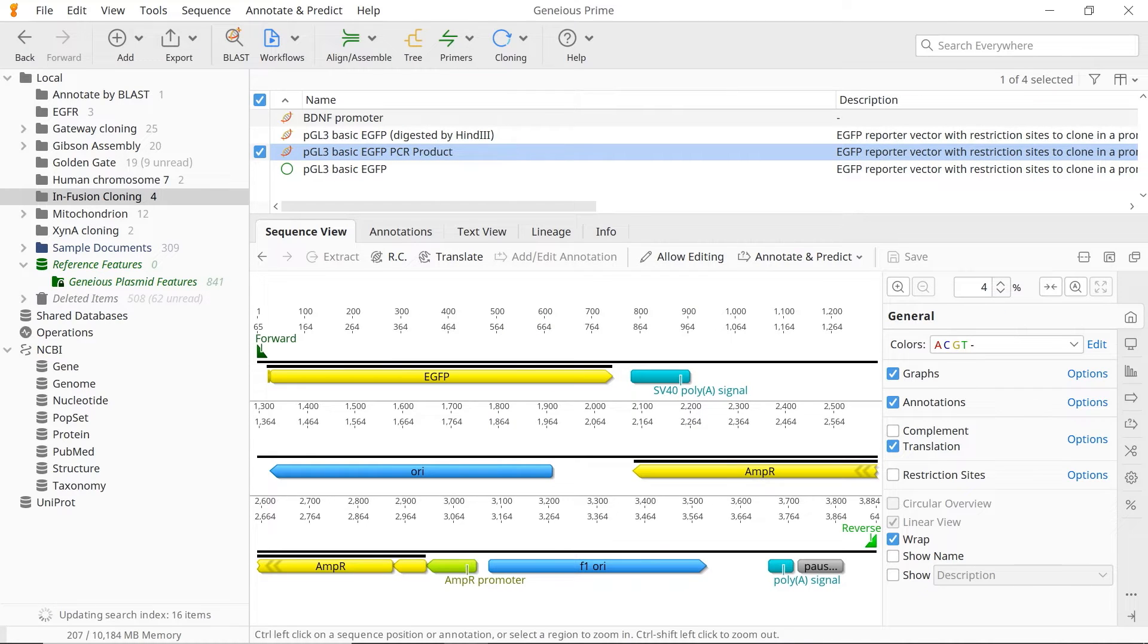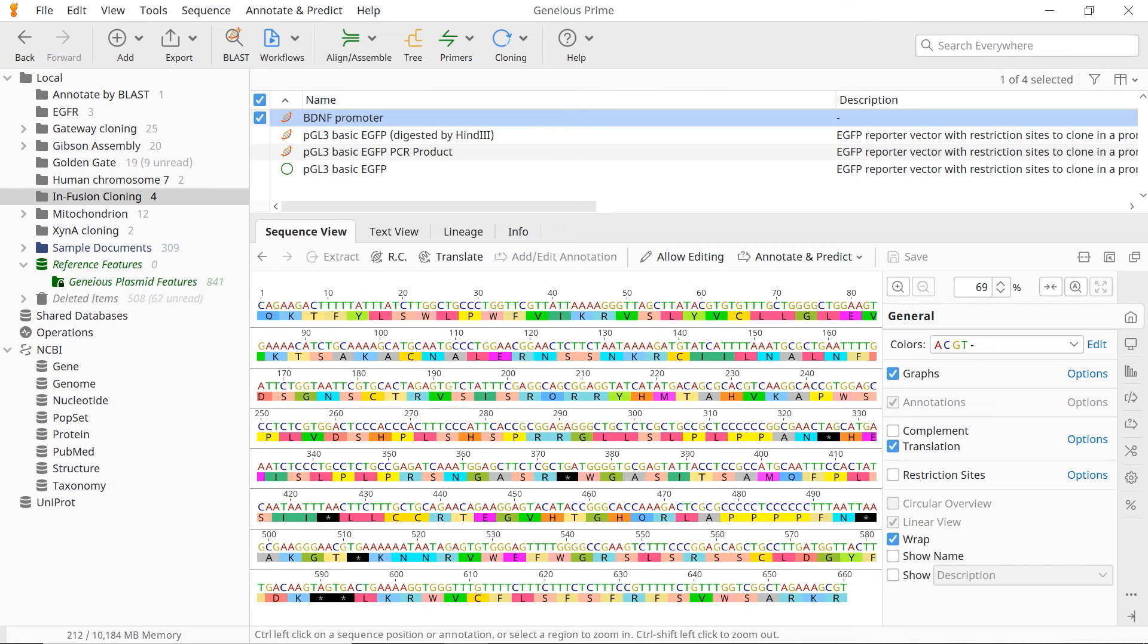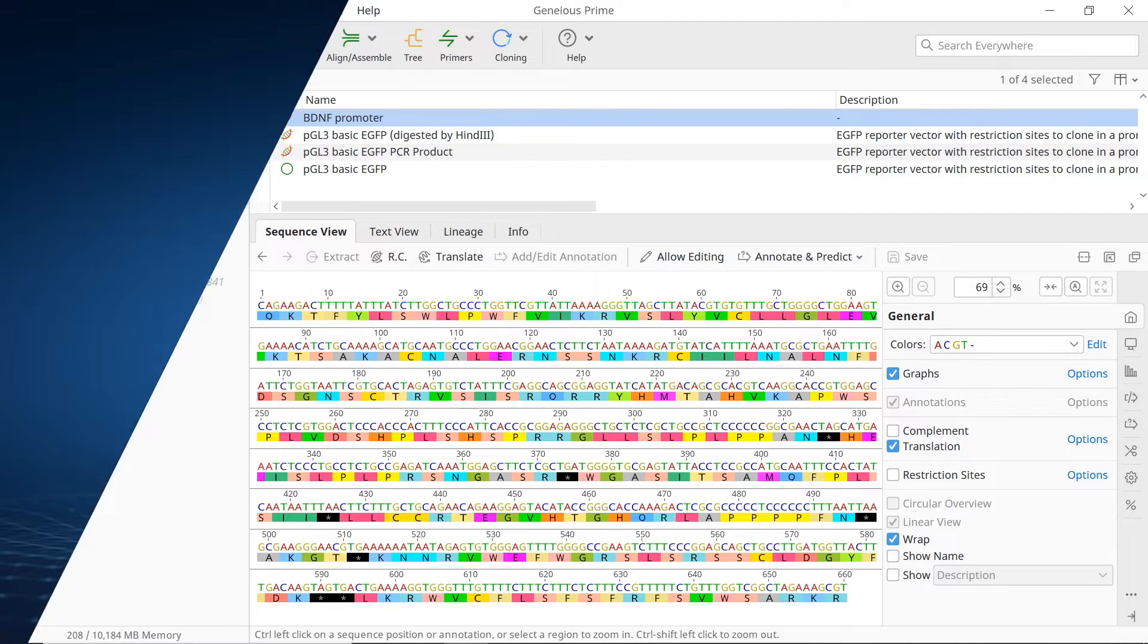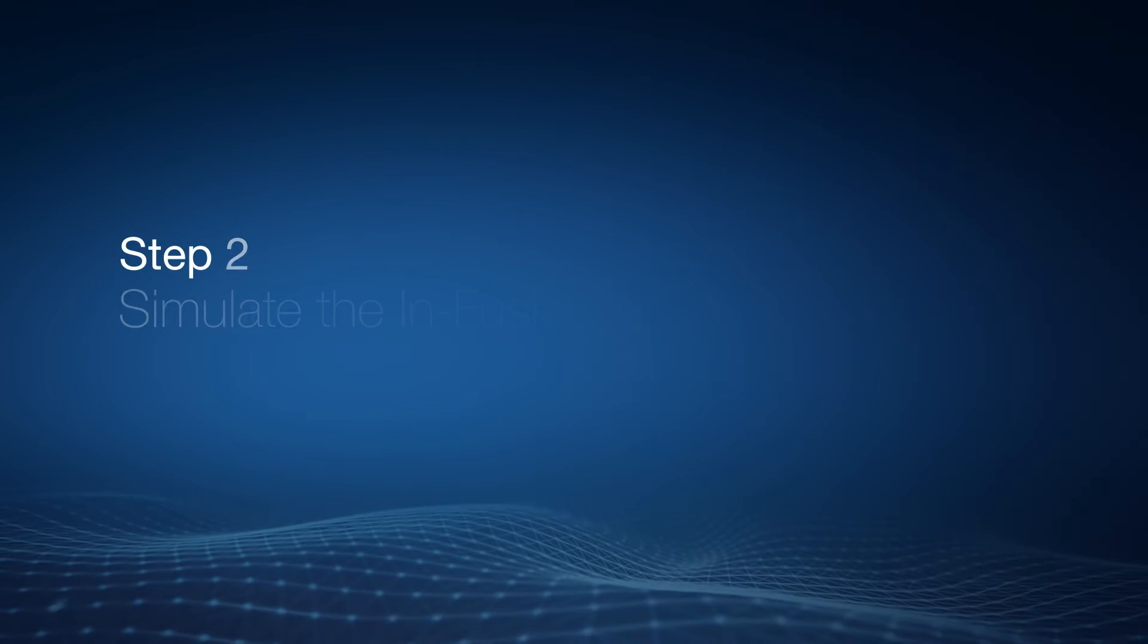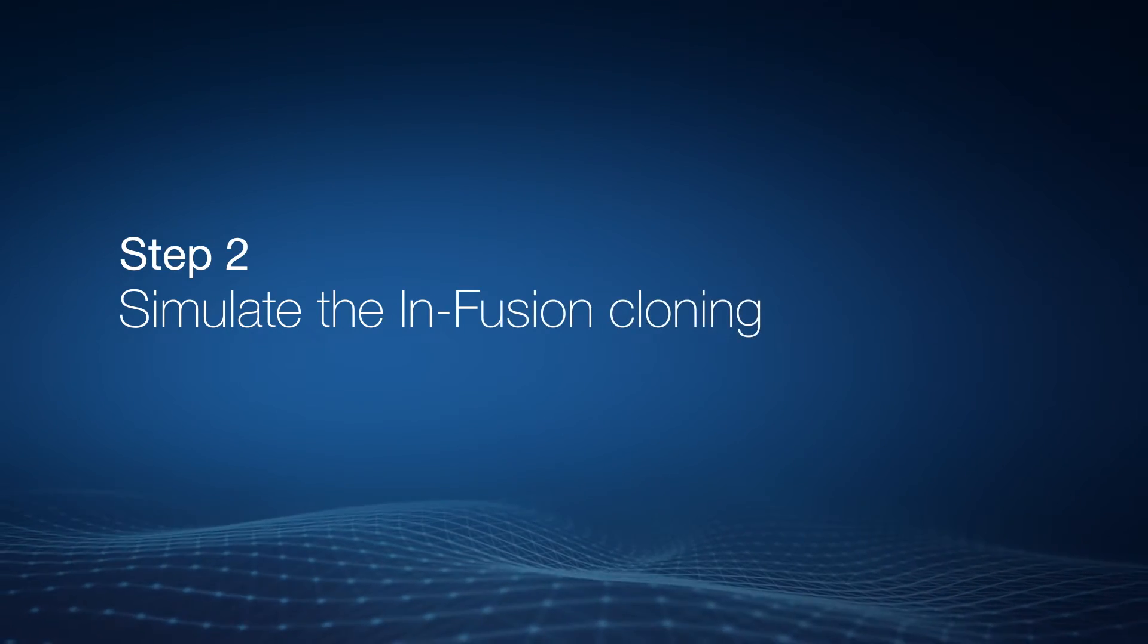And as well as a linearised vector, you will also require a file containing your insert. Now we're ready to simulate the infusion cloning reaction.